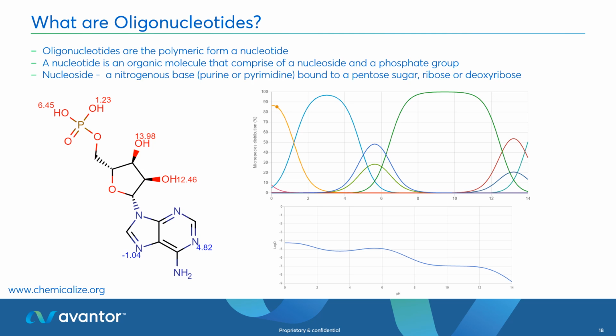This is problematic because all of those charged groups will interact potentially with charged surfaces, and on a chromatographic system we have to be very aware of that. If we're looking to run our chromatography on silica, silica is a charged species. It will potentially interact in some form with these types of molecules if we're not very careful.